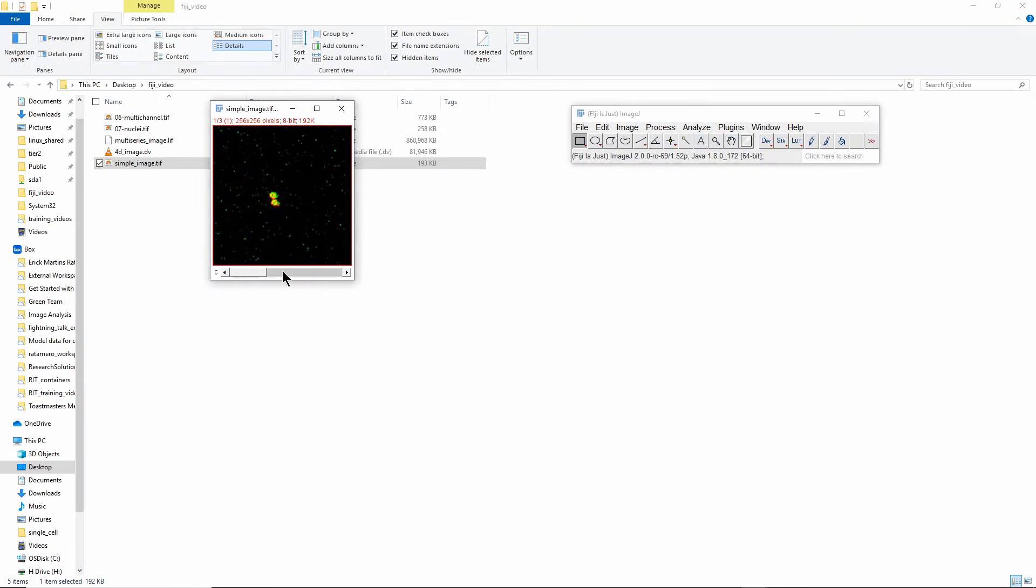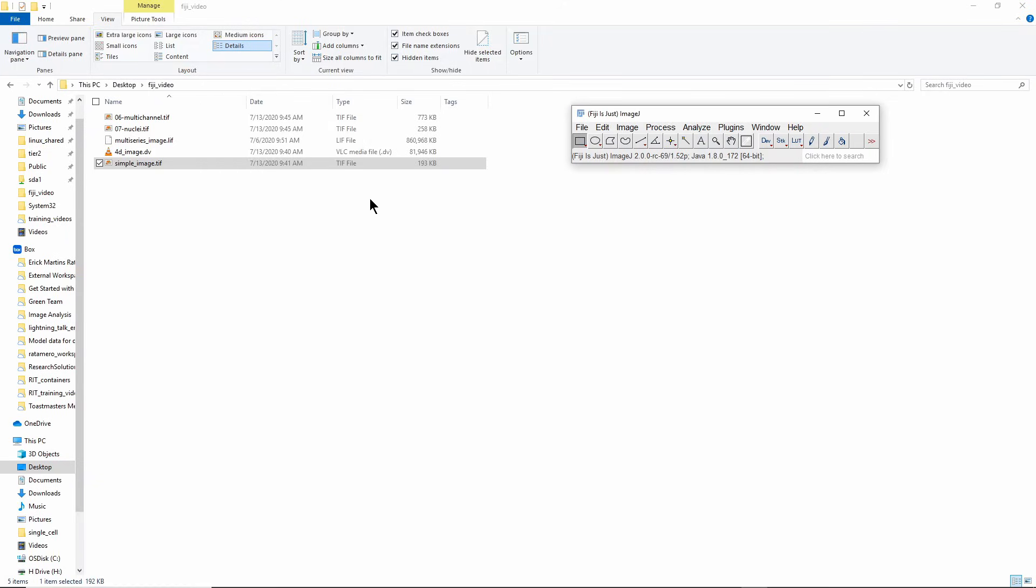In this case you can see it's an image with three channels. I'm showing all three channels at the same time here. If you have an image that is in proprietary format that requires BioFormats to open, Fiji can also do that.